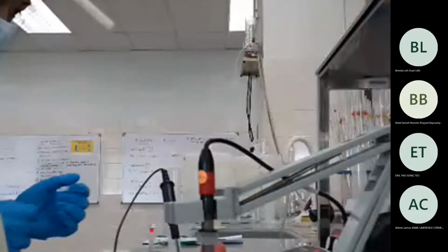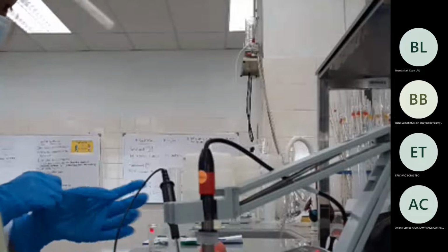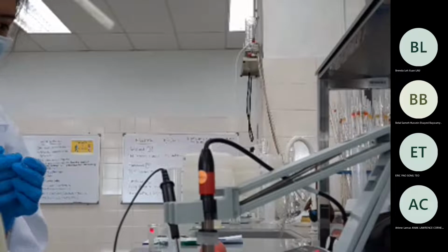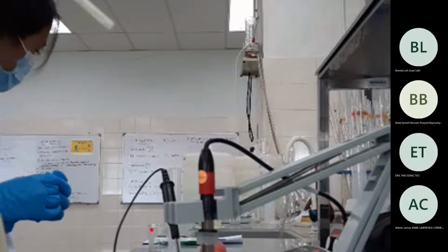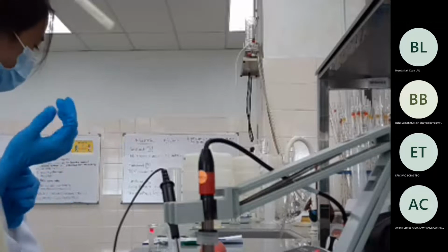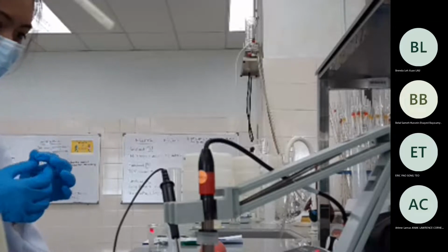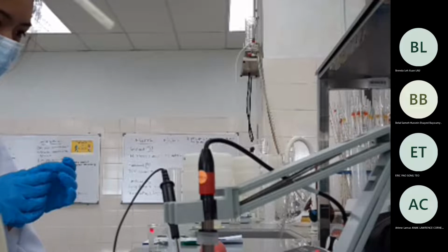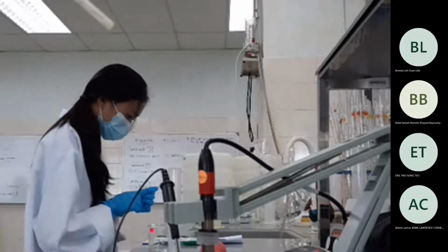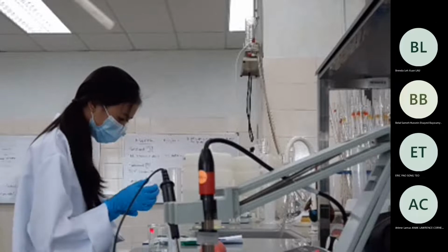Yeah. This is ethanoic acid. It will be around this figure. Sodium hydroxide. Ethanoic acid. That will be. Yeah, 56.